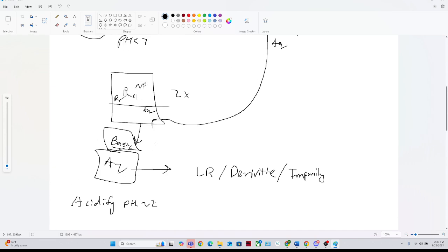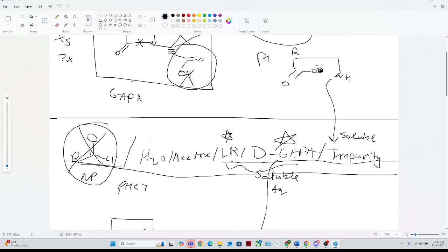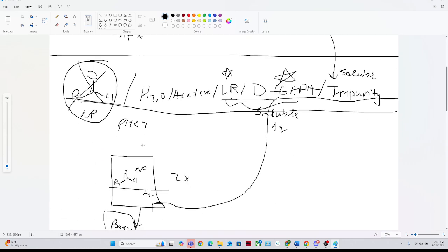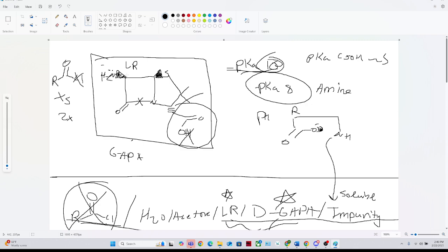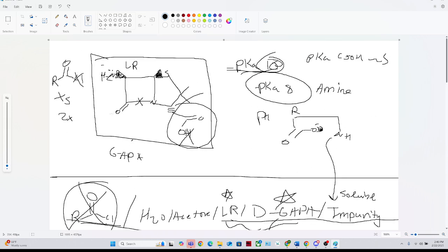The reason you don't want to go too far is that in your workup procedures, sometimes, if you're not quick enough, you can also start catalyzing hydrolysis. Again, you have this beta-lactam group, okay? If I drop this to pH 1 and let my thing sit in there, there's a great chance that I could do acid catalysis of this amide and do a hydrolysis reaction.